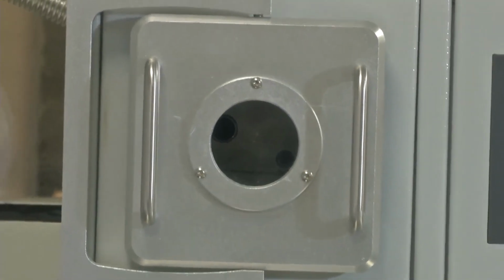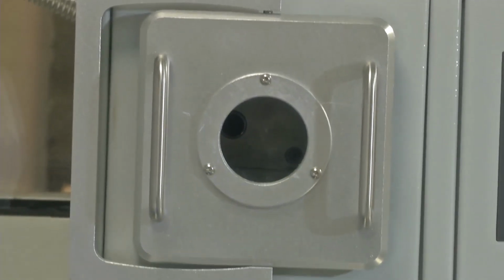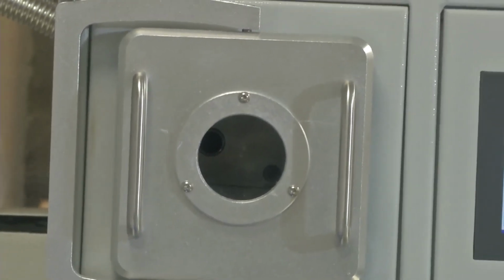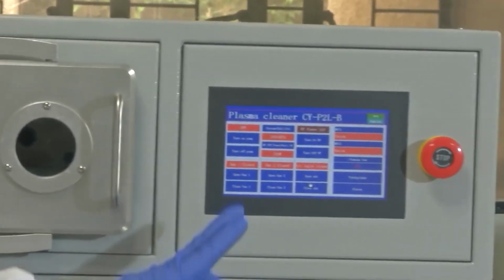Now we will do the same thing that I did before. You just look at the chamber. We will create plasma again. So what I will do, I will switch on the system. Okay, first I will turn on the pump.